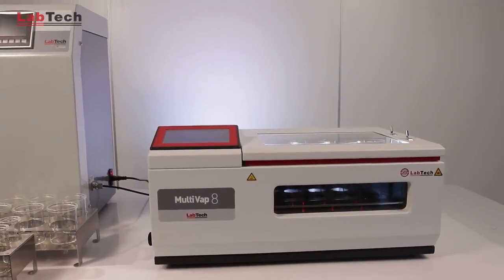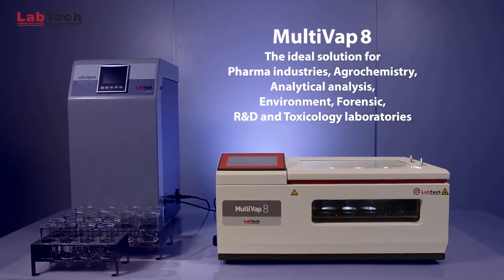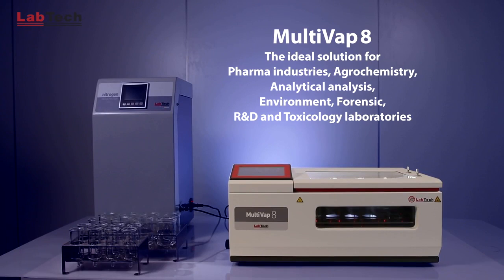The Labtech Multivap 8 is the ideal solution for pharma industries, agrochemistry, analytical analysis, environment, forensic, R&D, and toxicology laboratories.